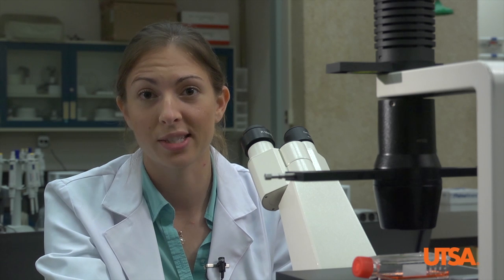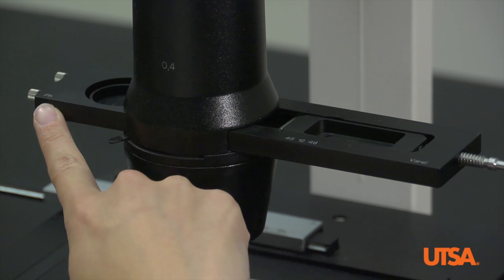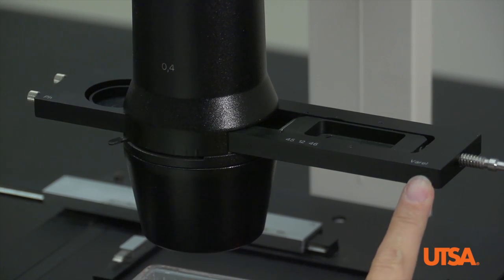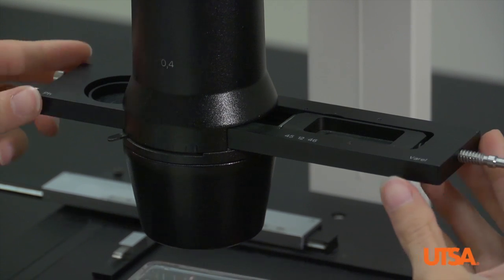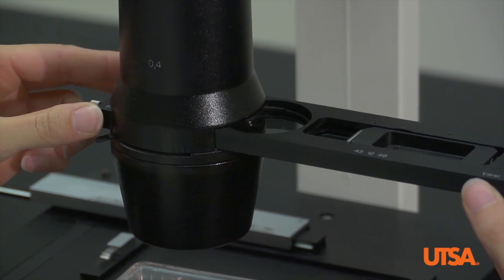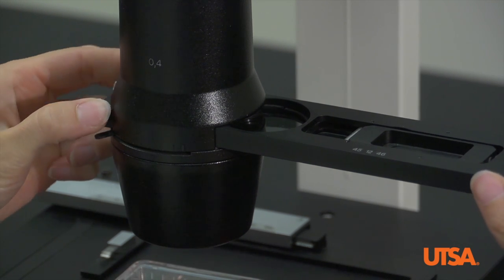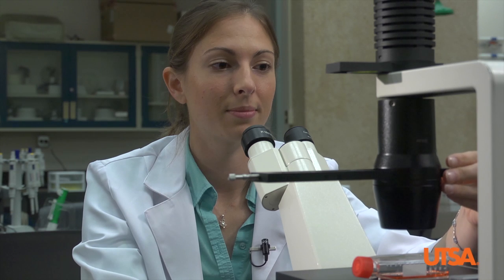Another common problem cell biologists have is that cells are translucent and we have to introduce contrast in order to see them clearly. This is the contrast slider and it has two positions: phase contrast and Varel contrast, which has two settings. You'll know you're in a position when you hear a click and feel resistance. Let's go back to phase contrast — you hear that click, which means you're in the right setting.